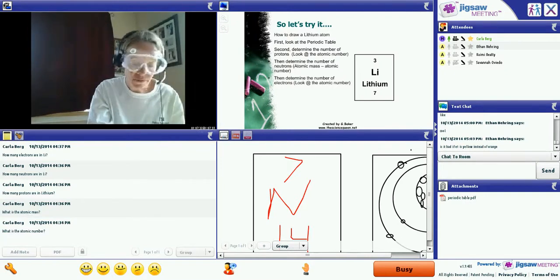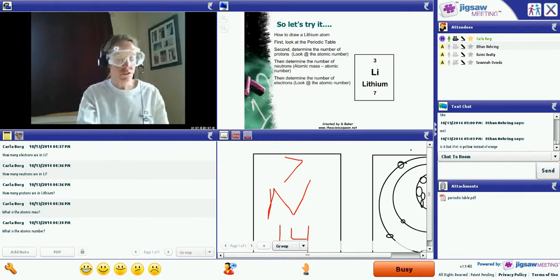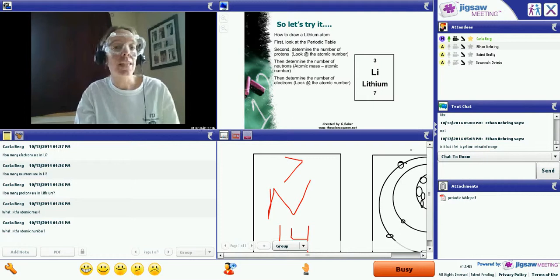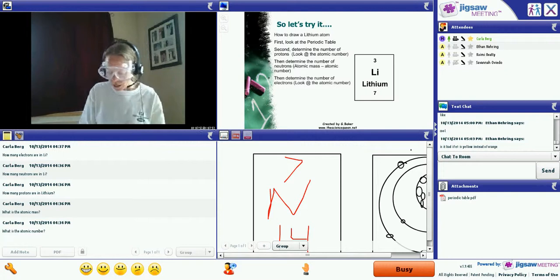Part B is very similar to part A, except instead of using the first column, number 1, we are going to do the last column, which is number 12. So the side all the way on the right-hand side of our well plate.